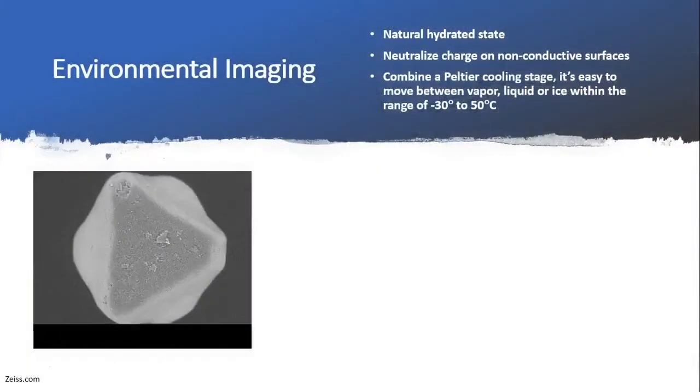Then we mentioned this is environmental SEM. Environmental imaging has a lot of advantages. For example, we can combine a Peltier cooling stage, so we can introduce water vapor to observe the crystallization of sodium chloride crystals.